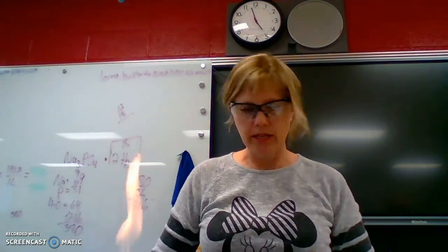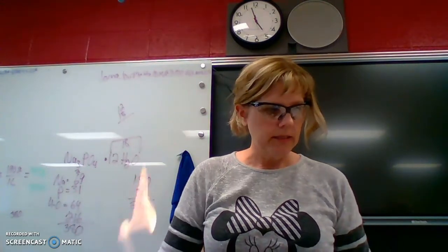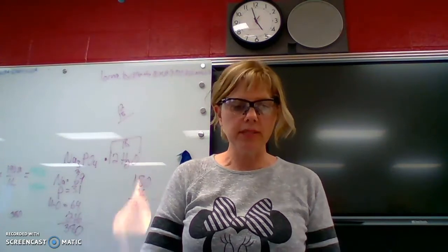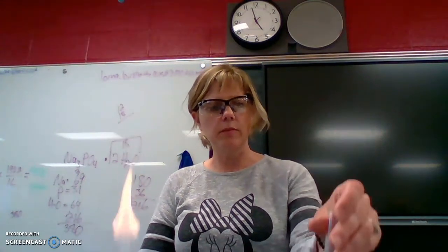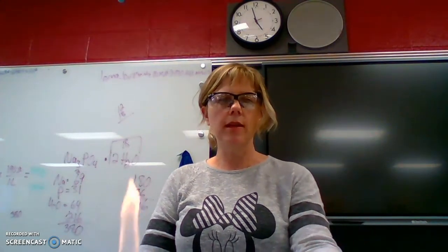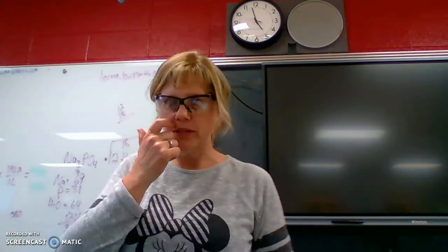I'm much safer when you are here because I'm working on my desk here, which you know is not always the greatest. But did you hear that popping sound? I think my reaction is maybe all the hydrochloric acid has been neutralized. That popping sound is very indicative of hydrogen being present.